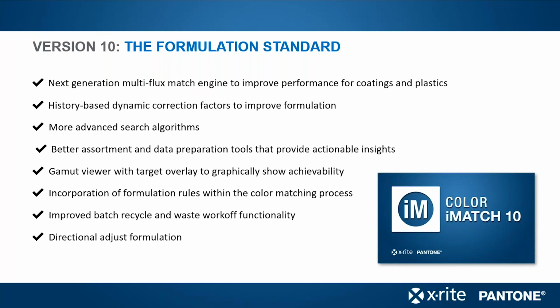We have more advanced search algorithms that utilize color and spectral shape to identify the footprint of the target and better identify the components that we think are in the formula, to give you better conversions. We've built a better set of tools in our calibration editor to help you make good decisions as you're building your calibration data, and provide you with actionable insights on that data.